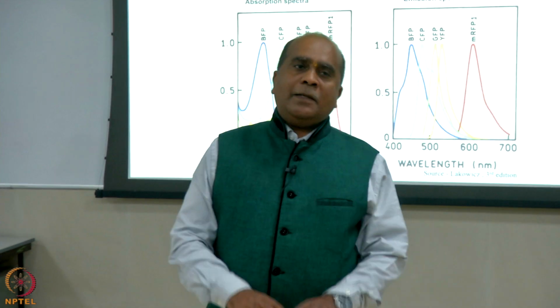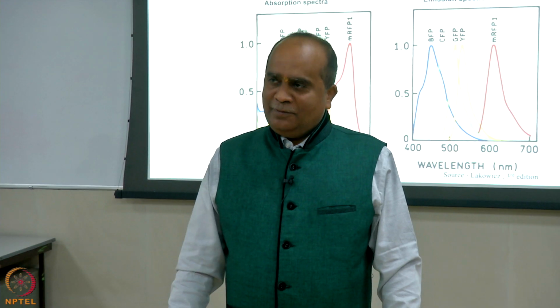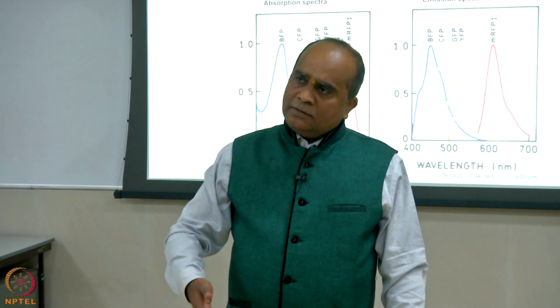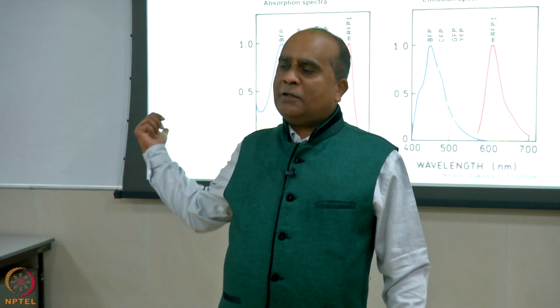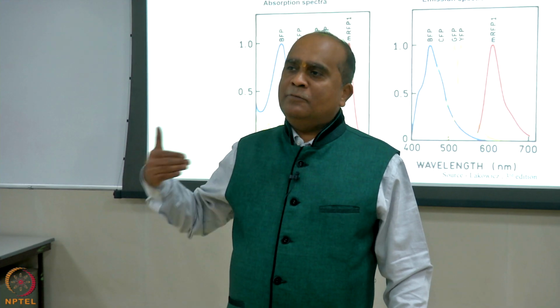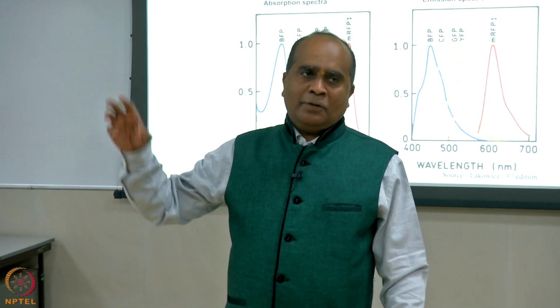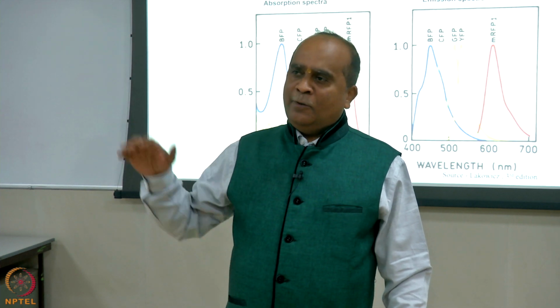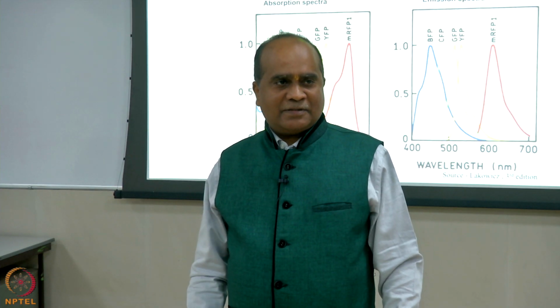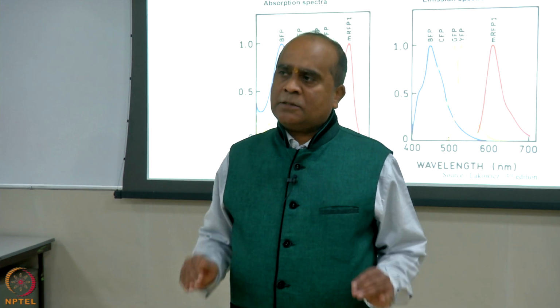So, it all depends upon what we want to do and how deep we want to go. A simple experiment was steady state fluorescence, then we looked at time decay fluorescence, now we are talking about inside cell imaging. So, you see if we want to do more and more, your instrument has to be more sophisticated, more money, more information, more patience. You have to be sitting in the dark for hours and hours to do all these experiments, right. So, that is what you have to invest in getting such deep knowledge.